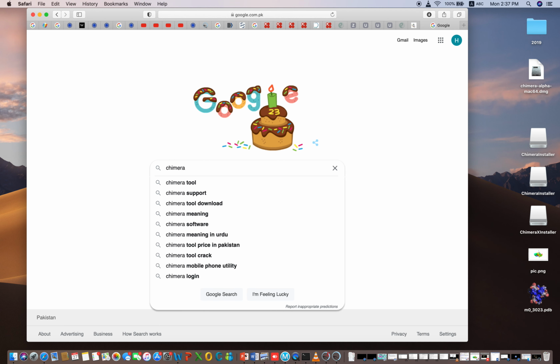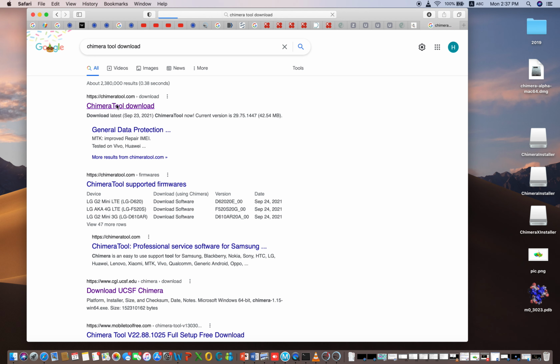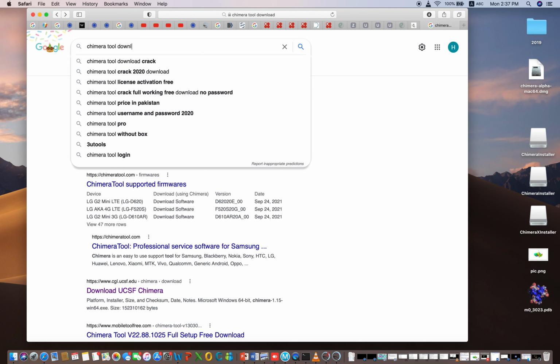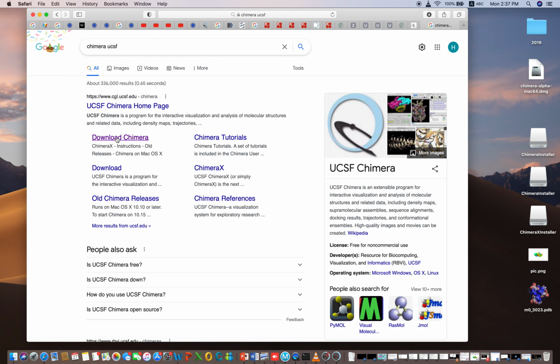Chimera tool download. No, this is not the official page of Chimera. Search for Chimera, University of California, San Francisco. This is their official page. Yes, this is the official page.